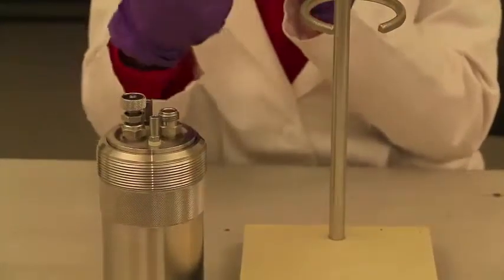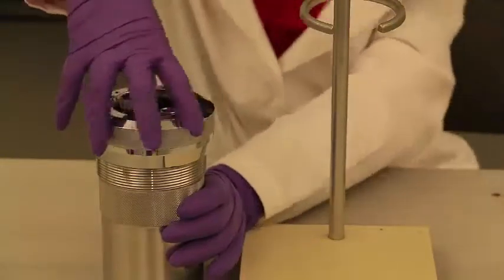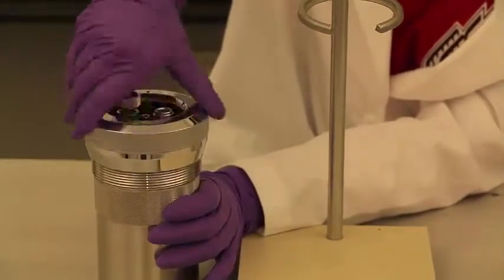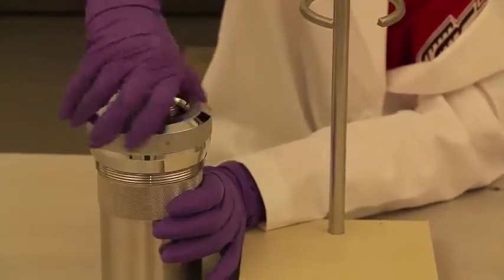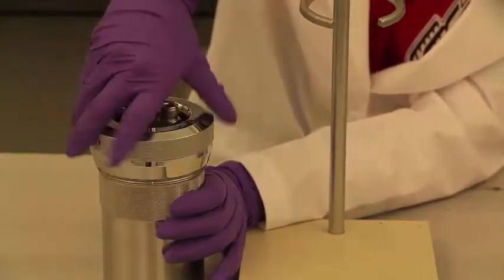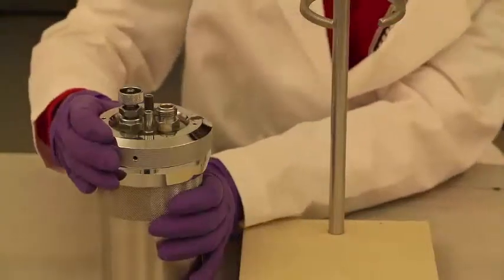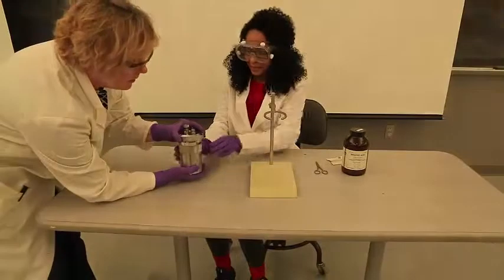Making sure the threads are aligned on the bomb lid and container, completely tighten the bomb lid. Have your instructor check the tightness of your seal before proceeding to the next step.